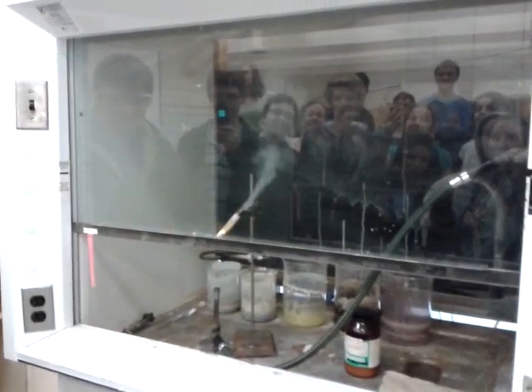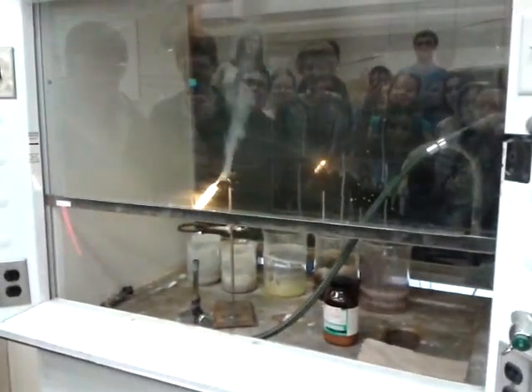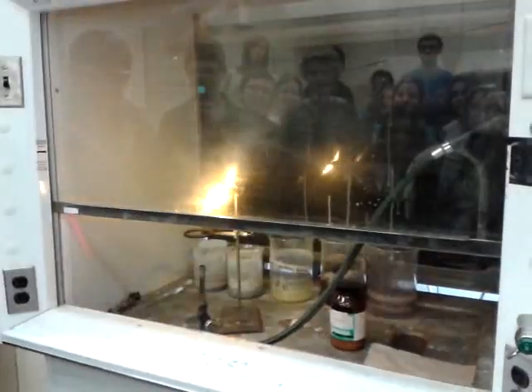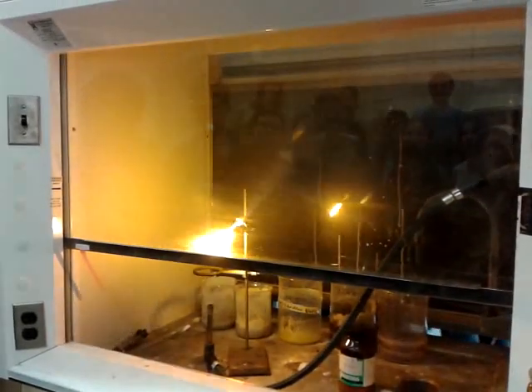All right. Whoa! Holy crap! Screams! That's awesome! So remember, there's no flame — we just sort of put the two chemicals together. Oh my god! That was awesome!